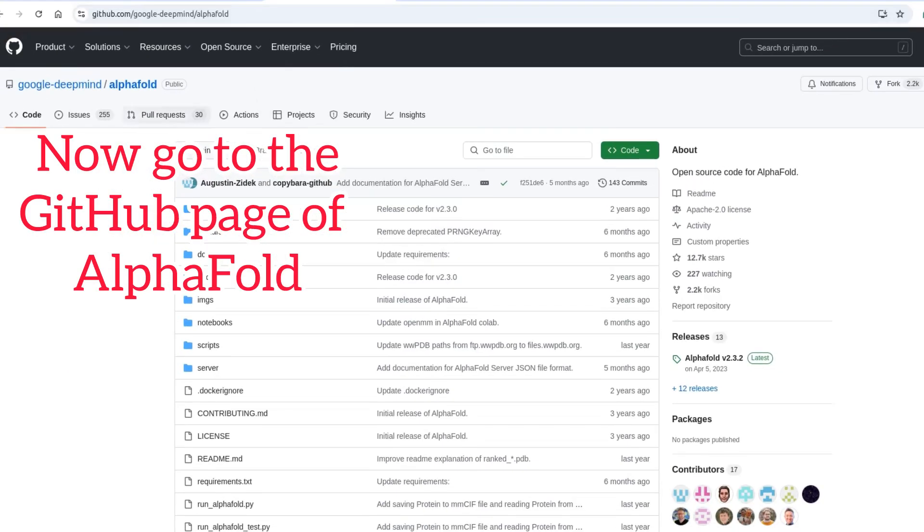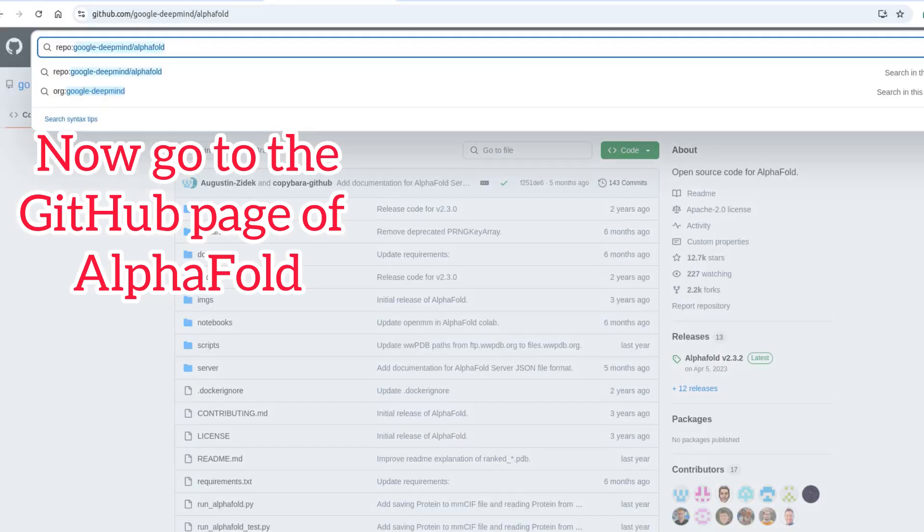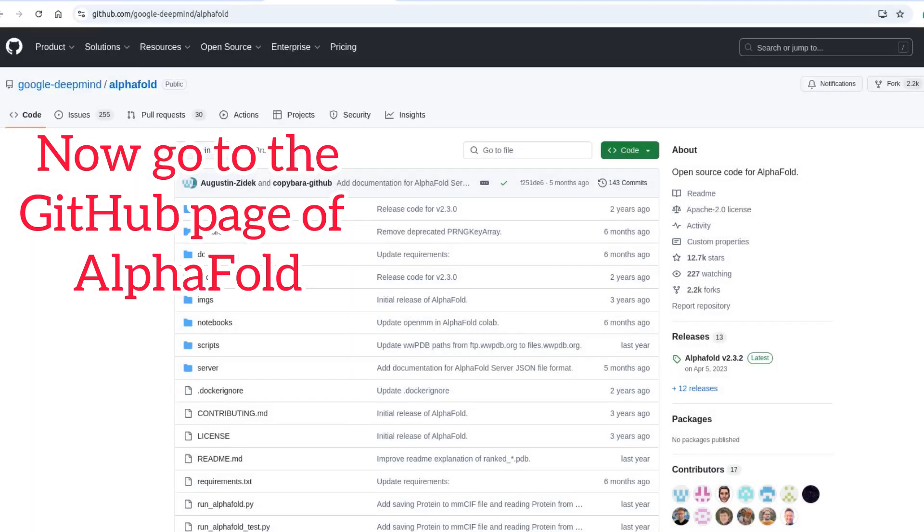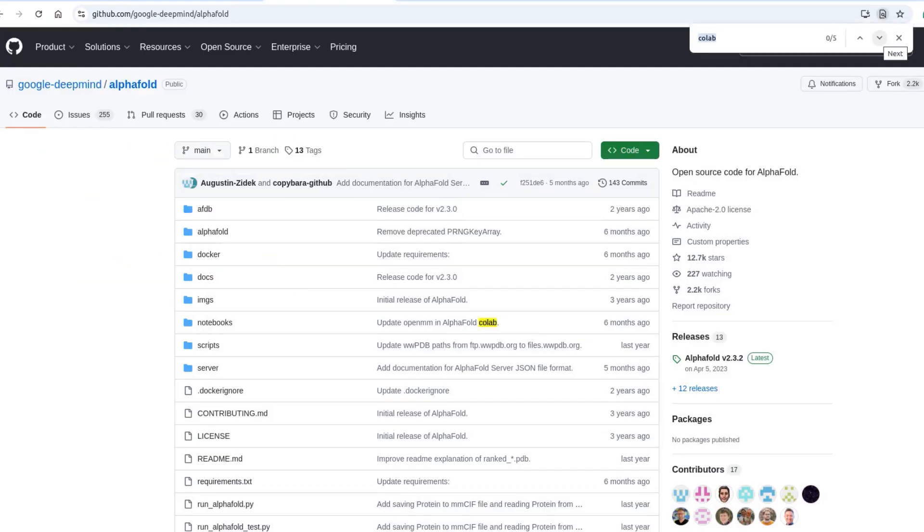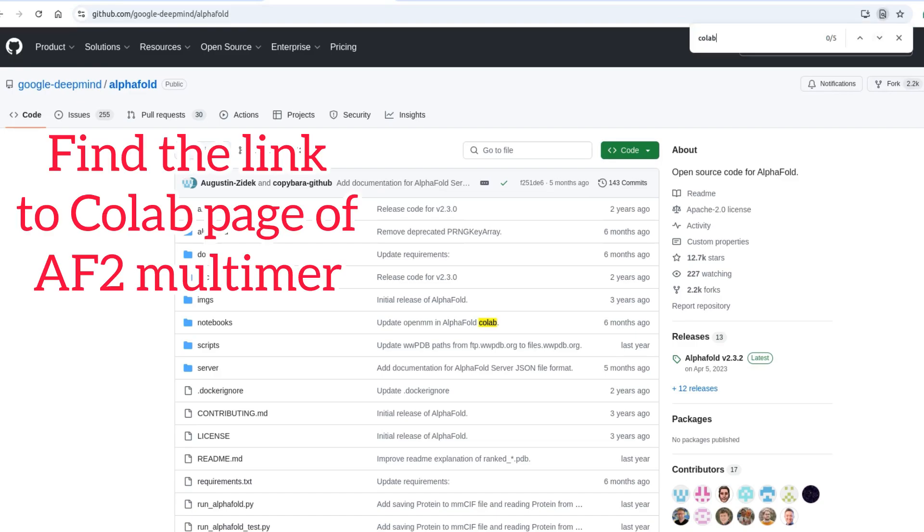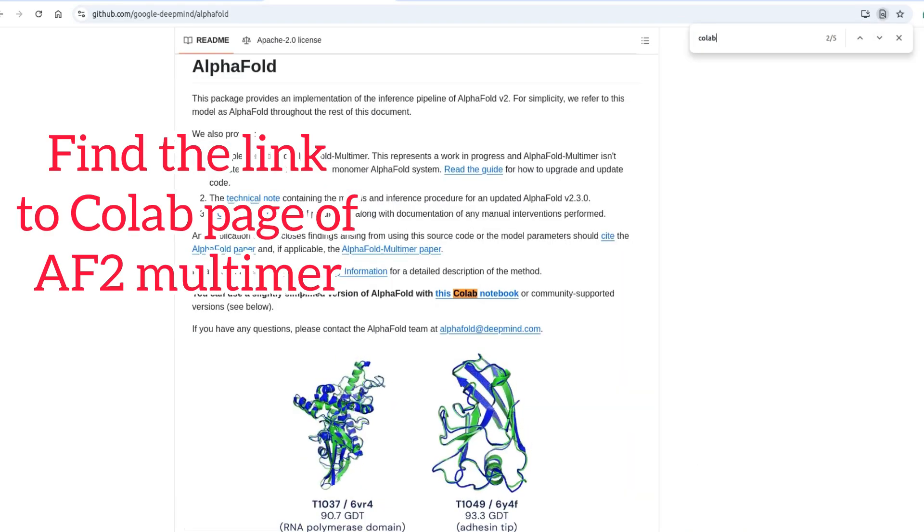Now go to the GitHub page of AlphaFold. Find the link to Colab page of AF2 Multimer.